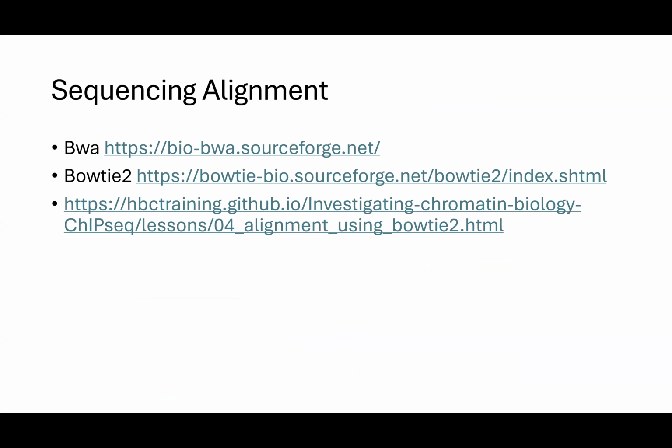So the first step is sequence alignment. You wouldn't want to necessarily use the same aligners that we did for RNA sequencing. We talked a bit about STAR and how it's able to take into account that exons from RNA are going to be spliced, so if you align to the genome, there's going to be a huge gap from the introns. With this, you don't have to worry because we took the DNA from the genome, so there shouldn't be any gaps really.